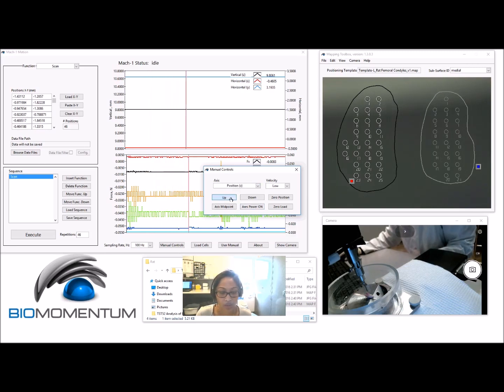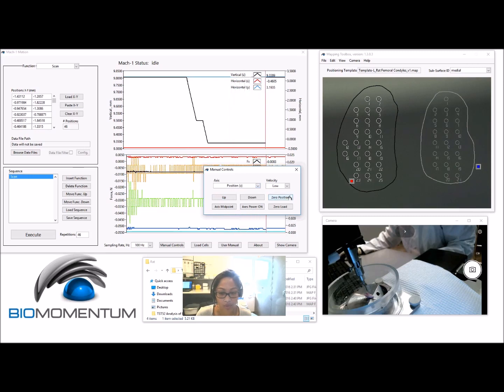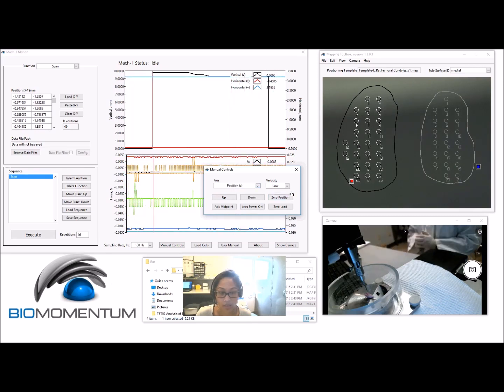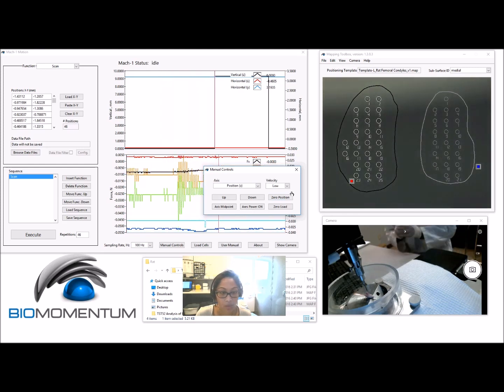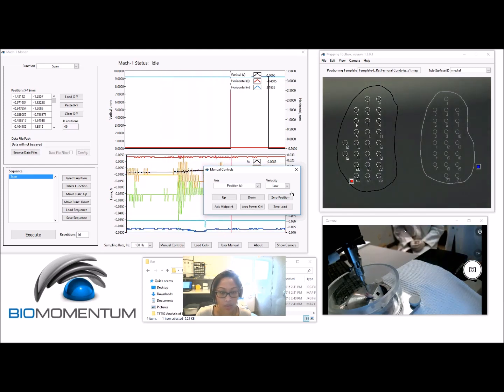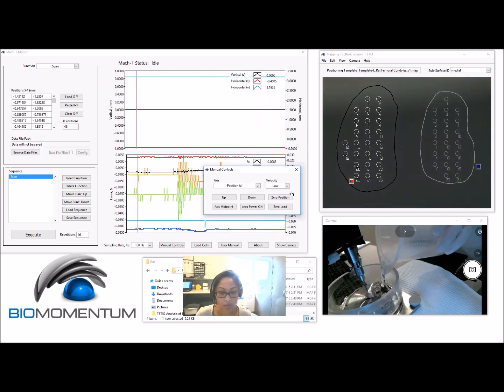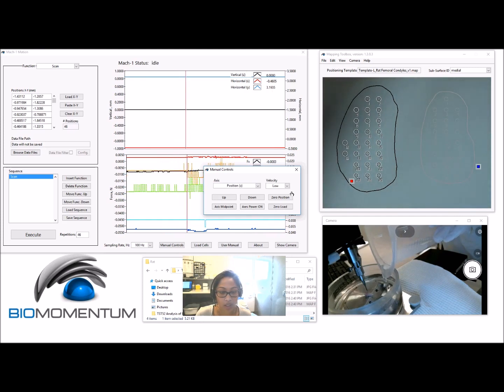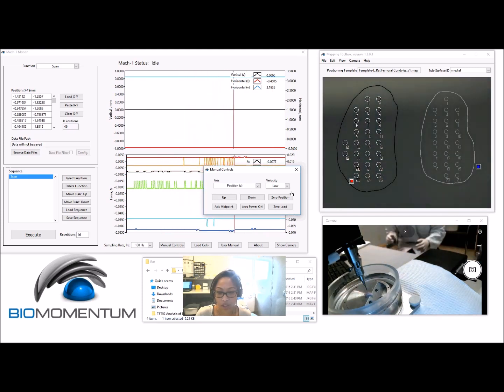Position the spherical indenter at approximately 2 mm over the highest point of the sample surface. Set the Z position to 0 and fill the chamber with enough PBS solution to cover the highest point of the sample by at least 1 cm, and allow a minimum of 15 minutes for equilibration.